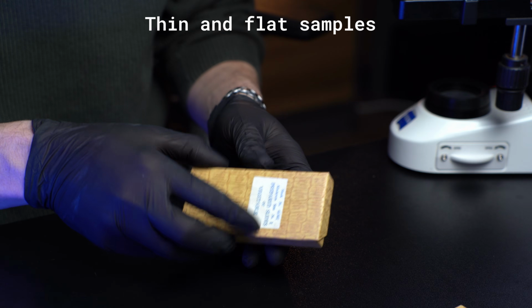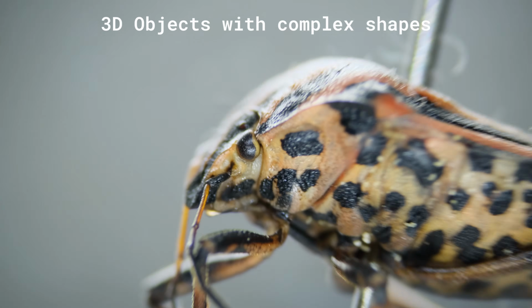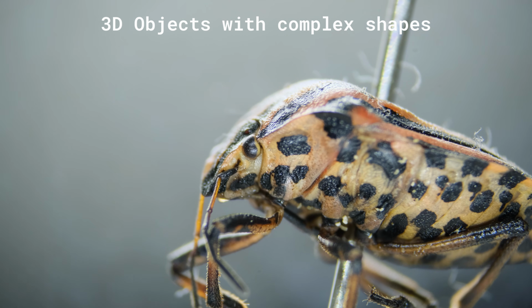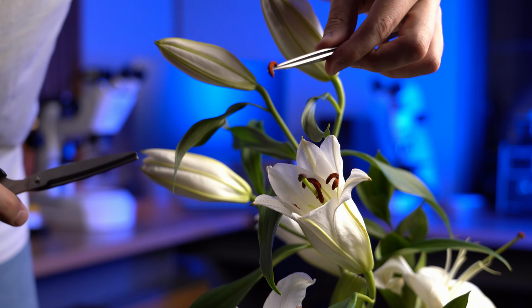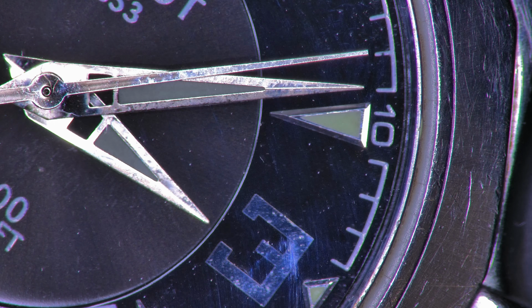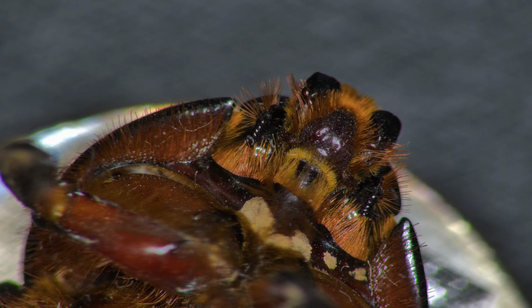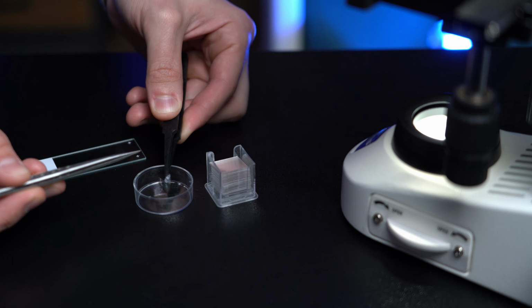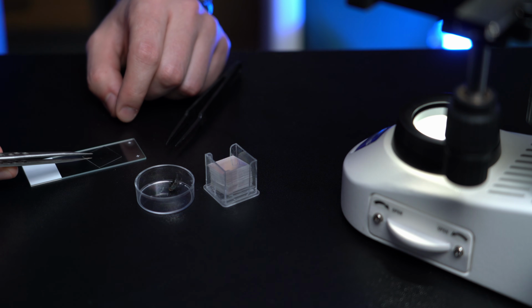Next, let's divide samples into another category. Flat, thin-prepared samples versus large, three-dimensional objects with complex shapes. Simple examples of complex 3D objects: river sand, plant stamens, coins, fibers, interesting micromechanisms like watch movements, some parts of microelectronics and of course insects. These are 3D and geometrically complex. You can prepare parts of them. For example, you can remove a fly's wing, place it on a slide under a cover slip, and now you've turned it into a flat sample.